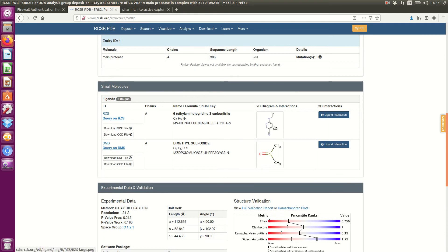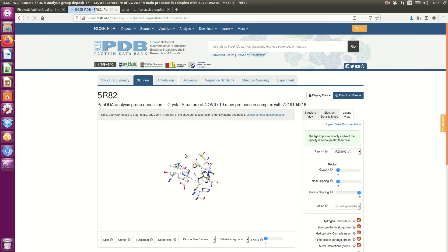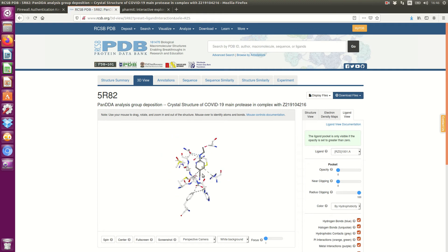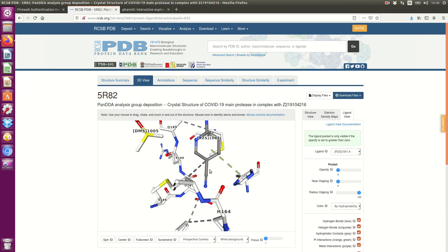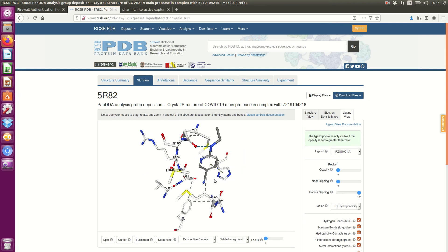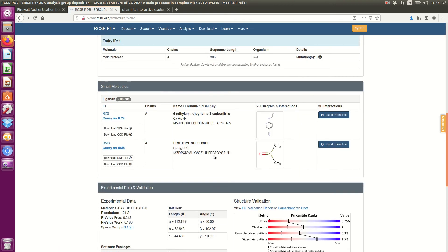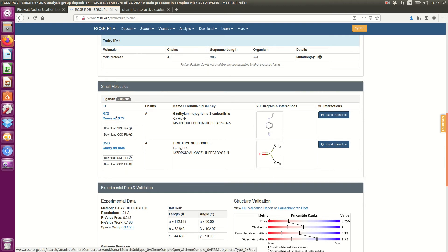And here is the ligand. You can see the interaction using this map. Now you know the molecular target and you know the lead compound.